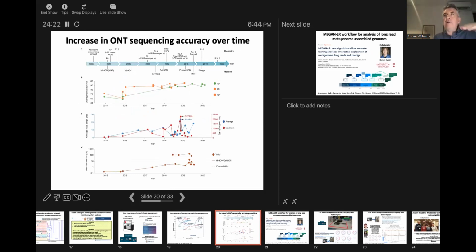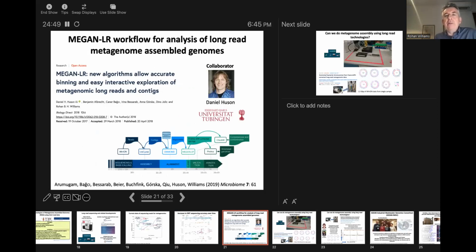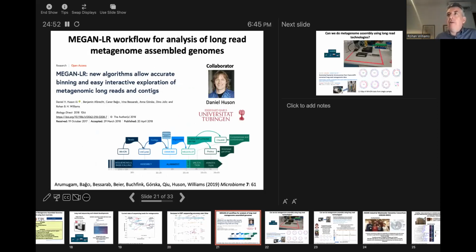And it's been an up and down situation. But now in 2022, the error rates are really very, very low. So this gives it a tremendous advantage. And we started working with Nanopore back, I think, in 2016. We did our first runs towards the end of September, October 2016, and I was very, very skeptical that this would work. And part of the reason for that was this high error rate.